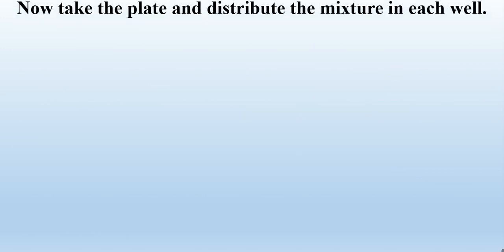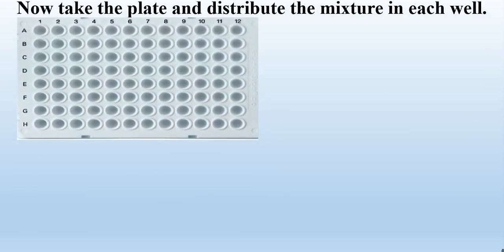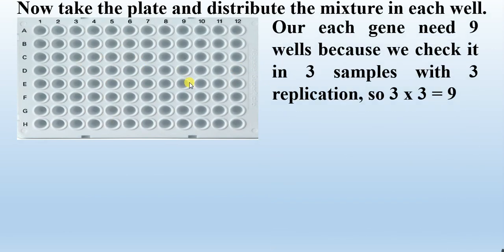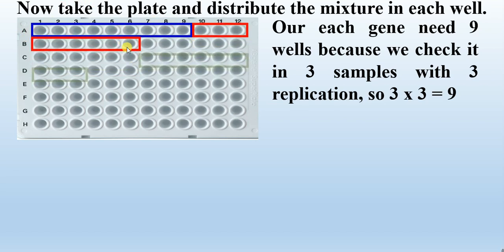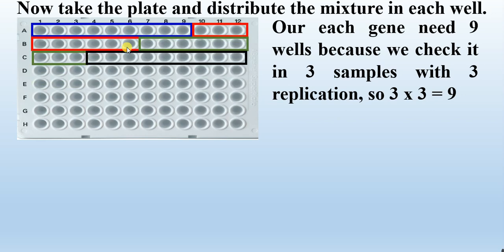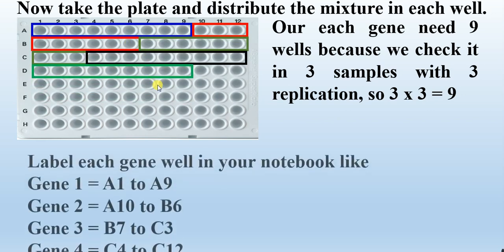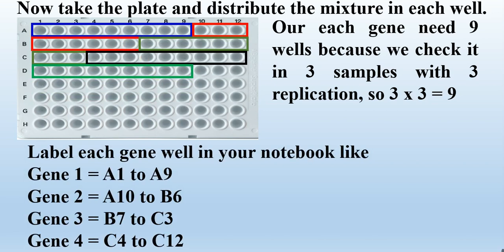Now take the plate and distribute the mixture into each well. Each gene requires 9 wells because we check it in 3 samples with 3 replications each (3 × 3 = 9). Wells A1 through A9 are for gene 1. Label each gene's wells in your notebook: gene 1 occupies A1 to A9.